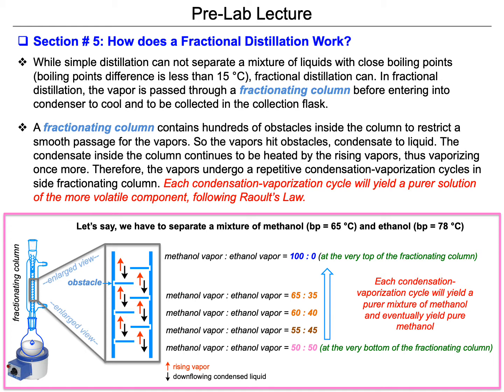We have the issue of close boiling points. In order to address this issue, we cannot use simple distillation.